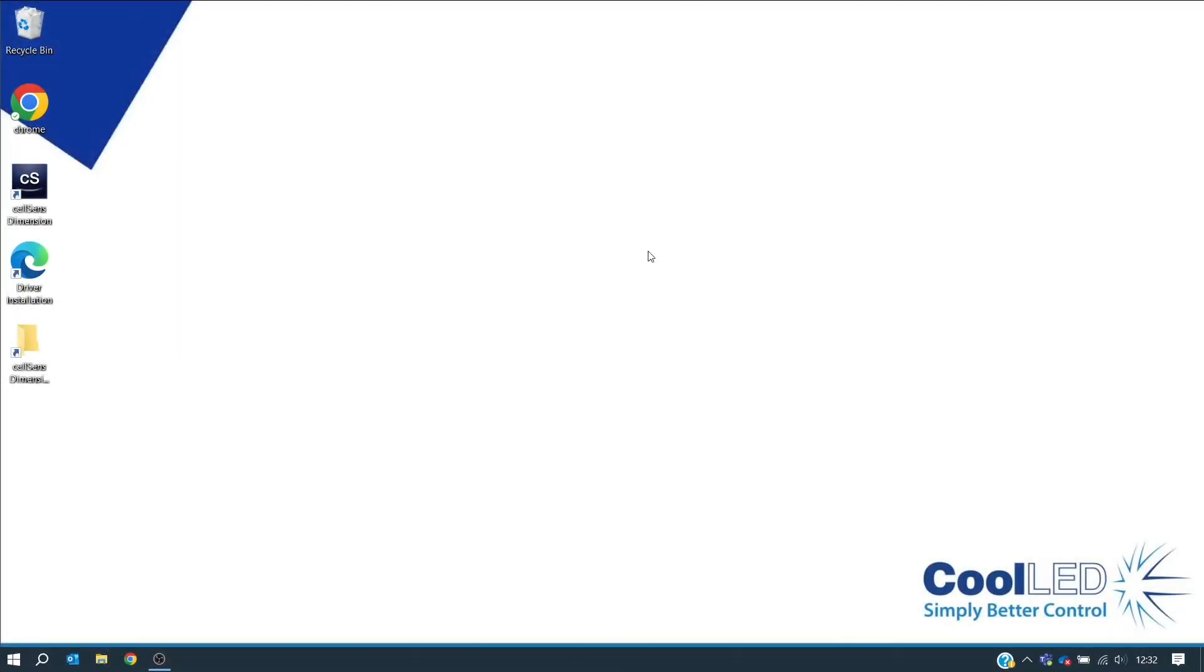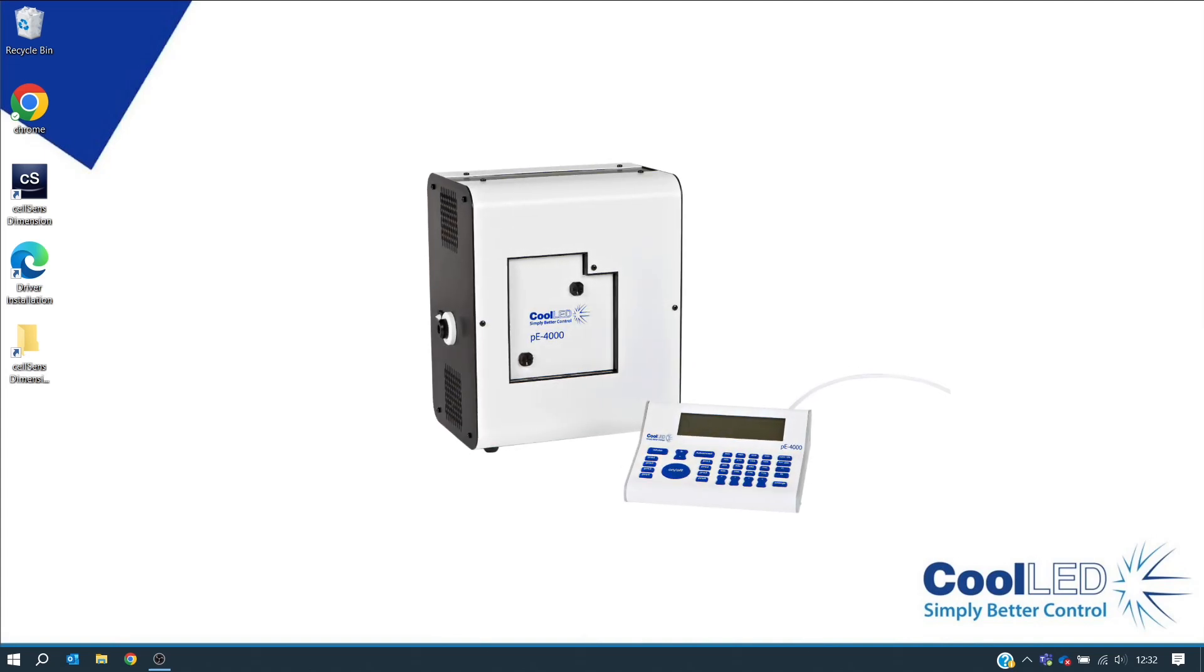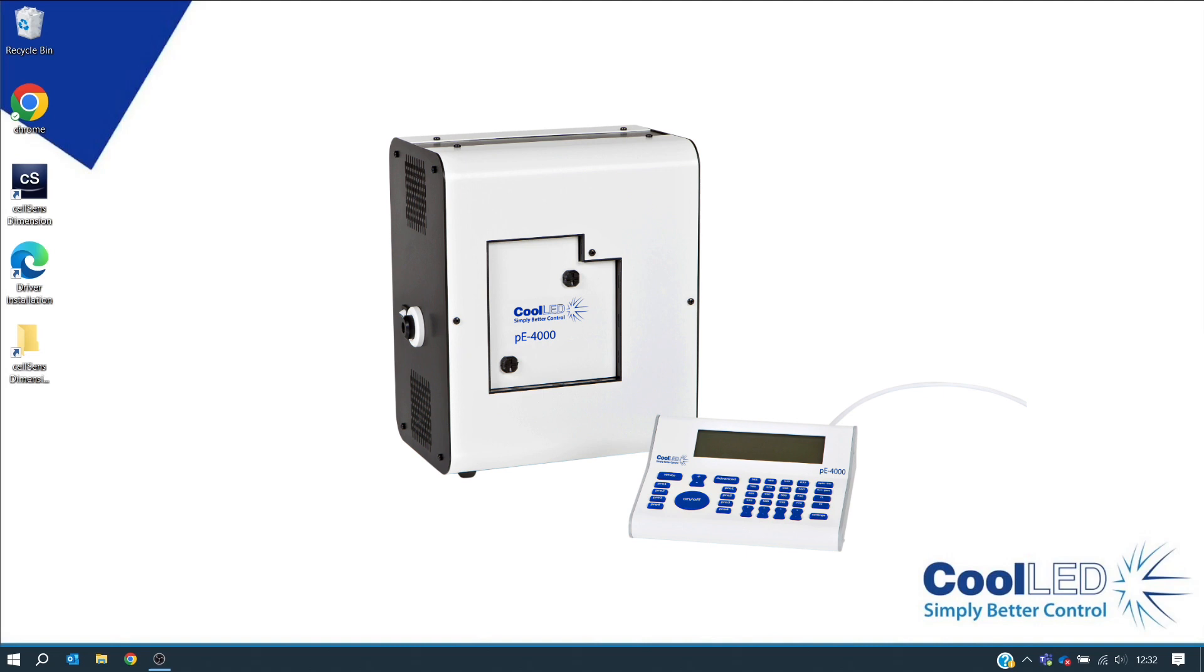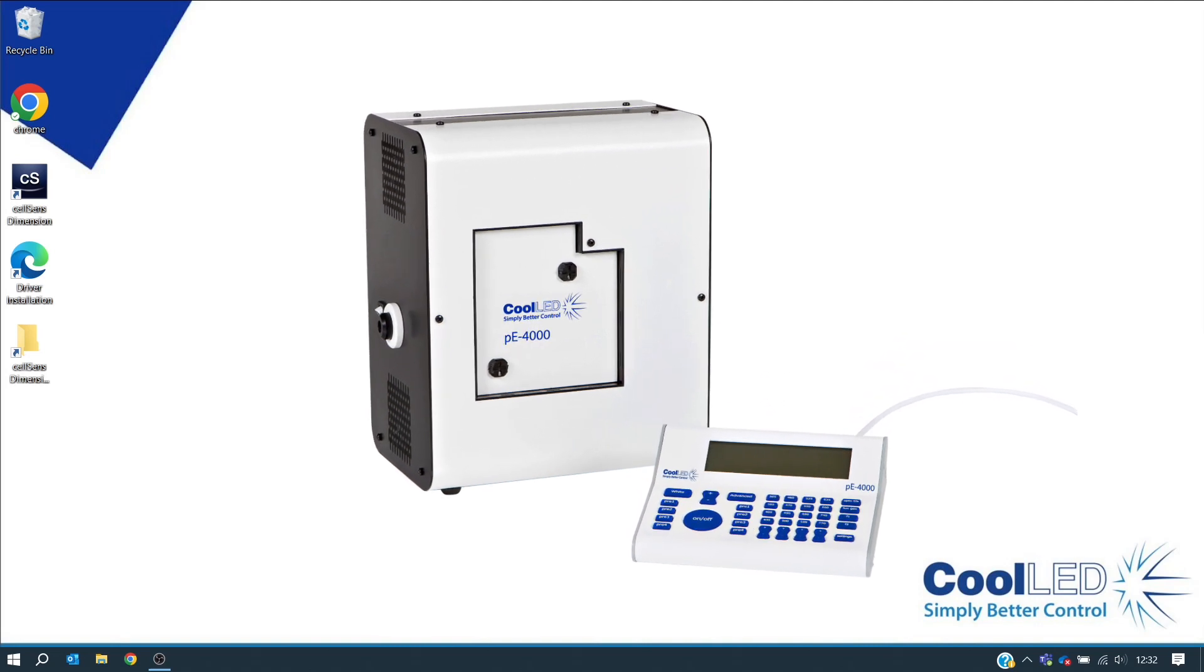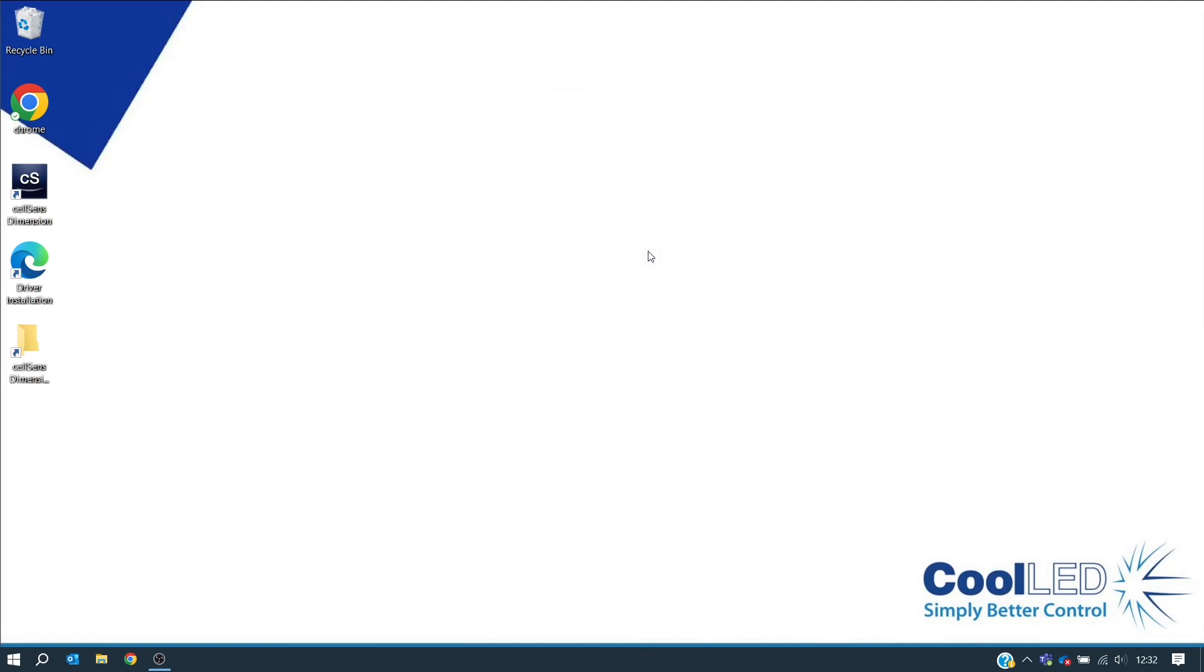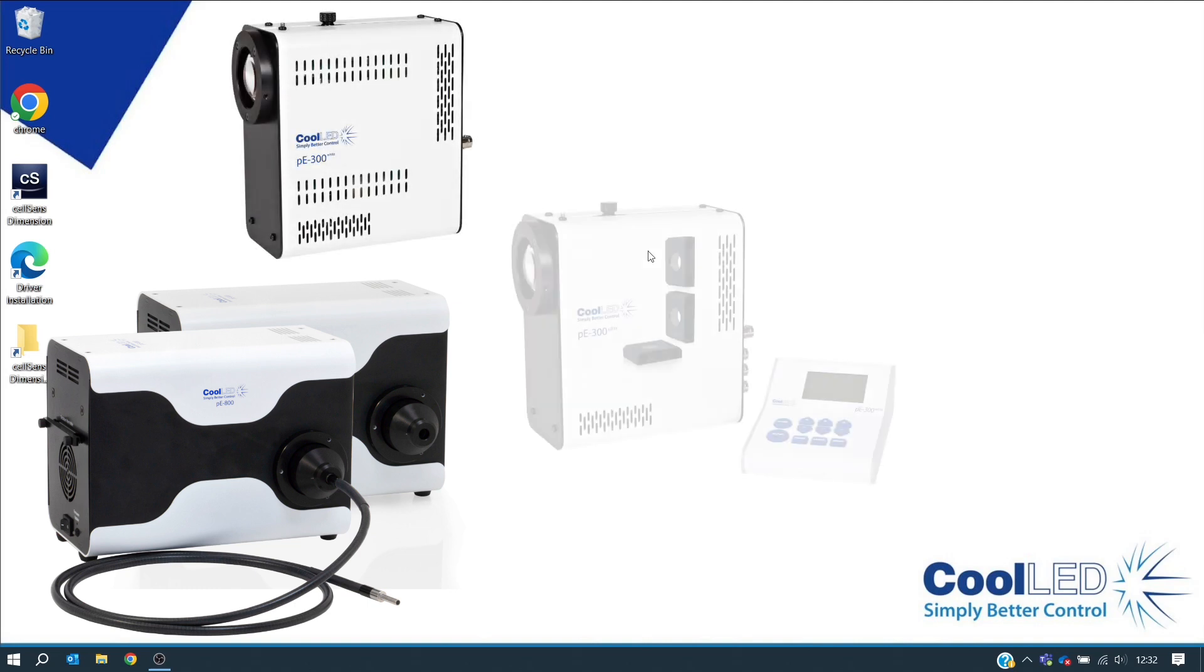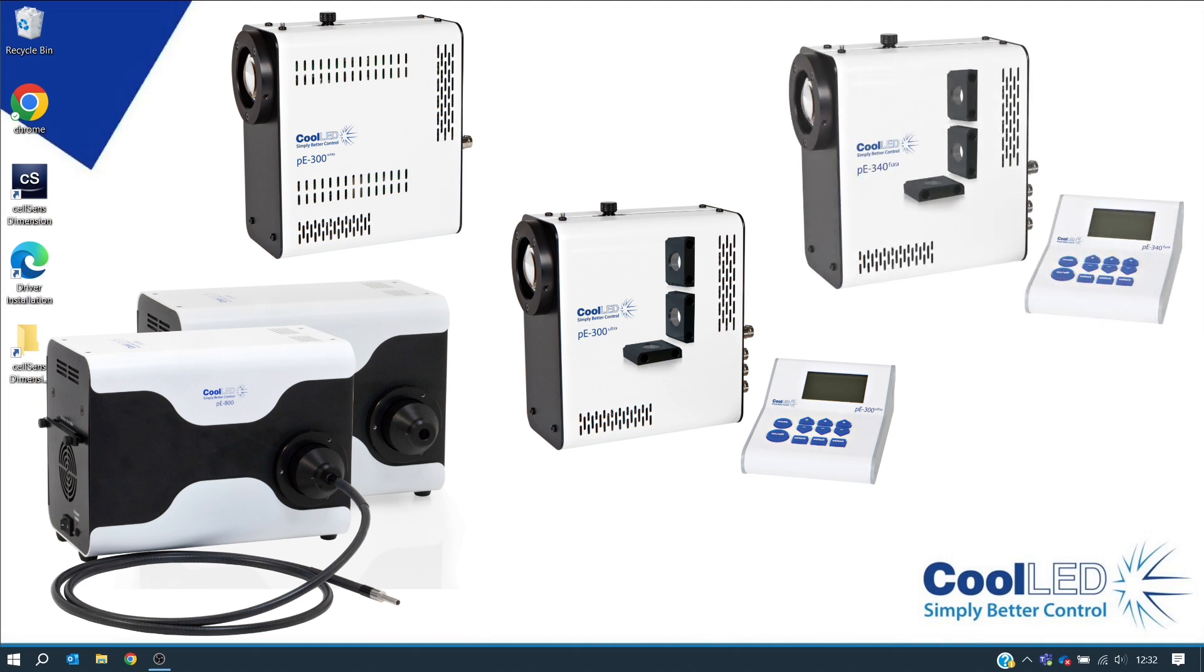Hello and welcome to this Cool-LED tutorial video for Olympus cellSens Dimension version 4.2. In this tutorial we will use a PE4000 to explain how to install and configure the illumination system and set up an experiment, but you can also follow these steps for other supported products: the PE800 series, the PE300 white, PE300 ultra, and pE-340fura.